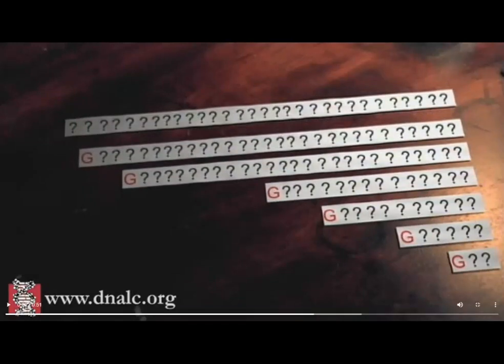Okay, I'm going to stop here because it is very important to understand what is going on during this process. This is a DNA sequencing technique, which is one of the most important facilities if you go to a lab having a DNA sequencer machine. So you need to know what the technique is and how it works.